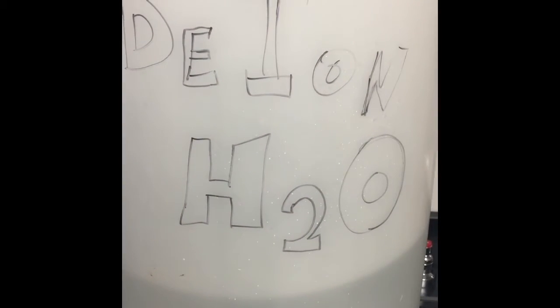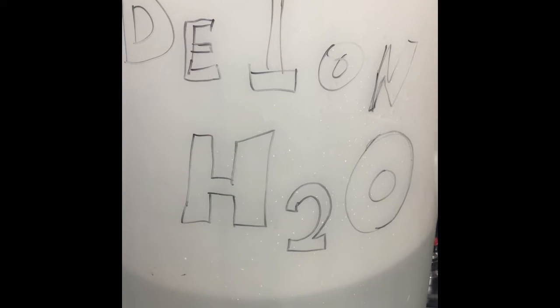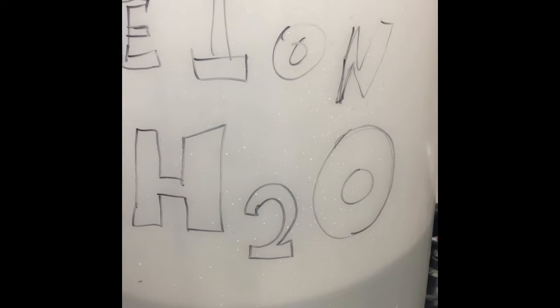So I've got a little bit of nitrogen dioxide gas that's still present in my reaction vessel. I'm going to add just a little bit of deionized water or distilled water. And what that's going to do, it'll dilute out the acid some, so it won't be quite as strong an acid, although it's still going to be quite dangerous. But also, that water is going to react with the nitrogen dioxide, and it's going to remove it from its gaseous form and produce an acidic product that's dissolved in the water. So let's do that.